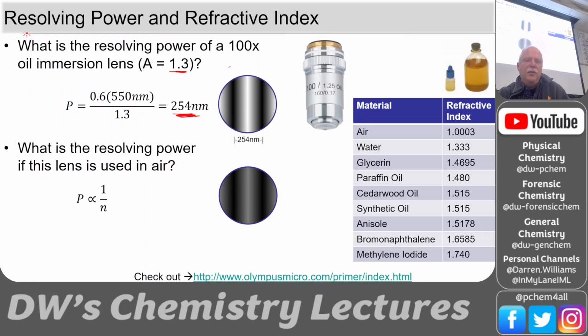So these two items could be that close together and we would still see a gap between them. So if you were to plot this, you would see the object, and it would be baseline resolved, and then you would see the next object.